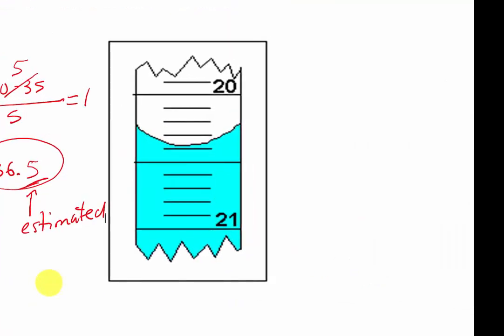Let's try another one over here. We have 21 to 20. Whoa, wait a minute. In some cases, when you have a burette, it's going to be reading the opposite. But we will still apply the same concept.